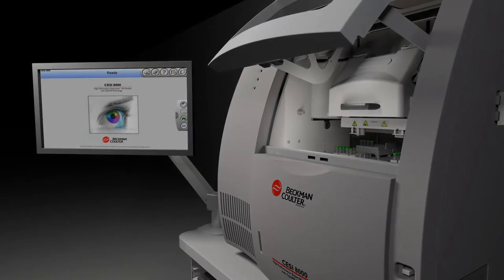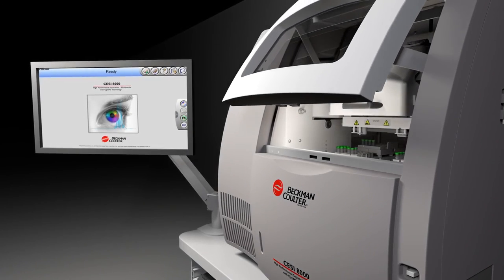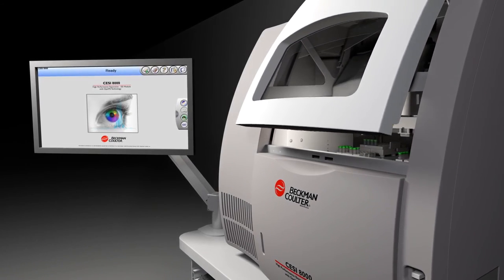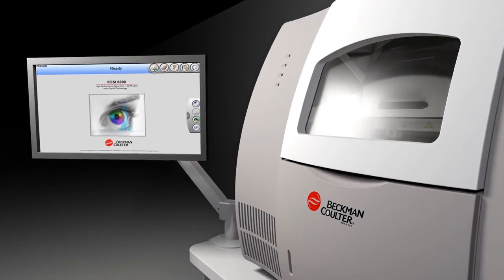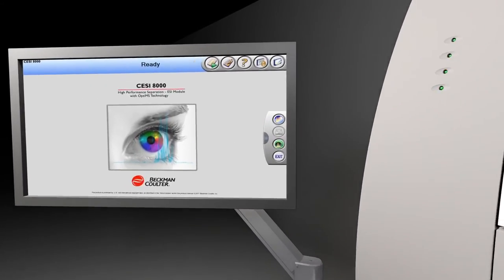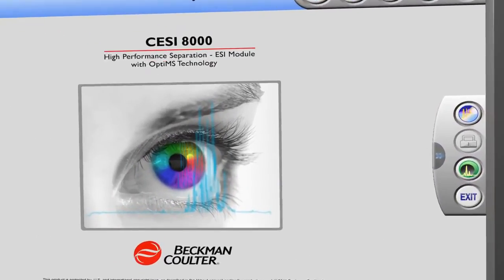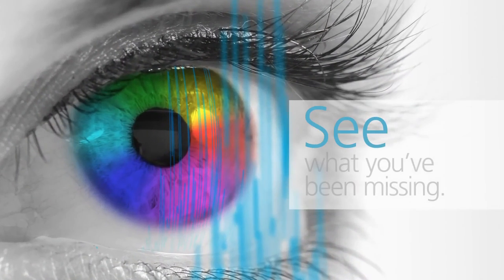The CESI-8000 comes with adapters that allow easy coupling to mass spectrometers. Isn't it time to start seeing what you have been missing?